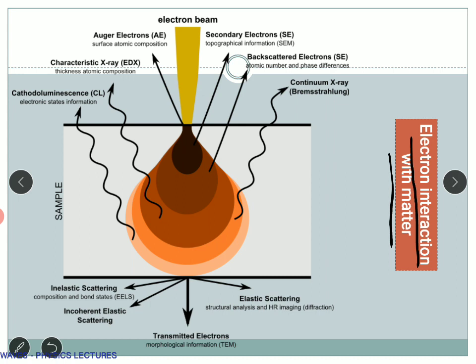Some of the processes which I have already studied is something called the characteristic X-ray in the XRD technique, where we have a high energy X-ray hitting an inner shell electron, displacing it, and a higher energy electron will fill the space, and then some kind of X-ray is emitted, which is the characteristic X-ray. But in this case we don't have a high energy X-ray, we have an electron beam. It can also do the same thing, it can dislodge an electron, and as a result you are going to get some kind of X-rays from there.